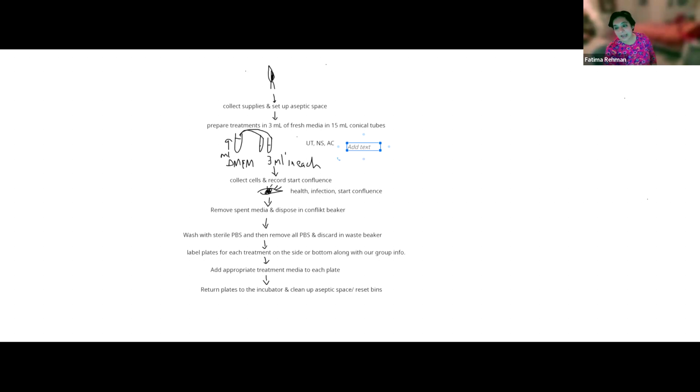Sterile micropipette, exactly. And where do you find sterile micropipette? Where do you find the sterile tips? Nice. Exactly. So add treatments to tubes using sterile tips, autoclave tips. The line tape is basically that they have been autoclaved to sterilize. Autoclave tips from the instructor guides.